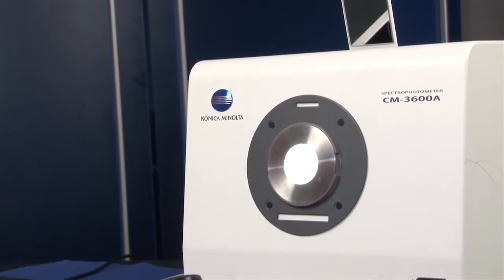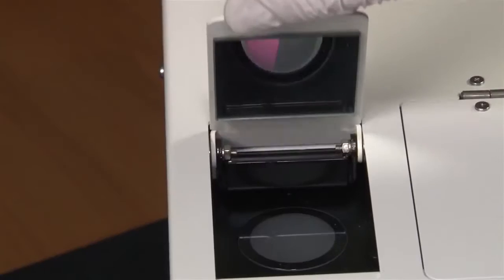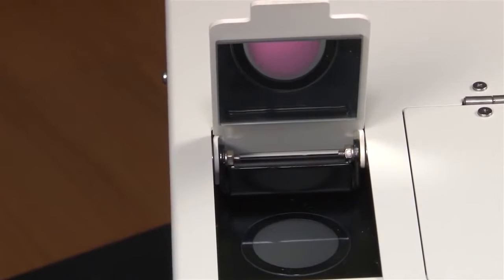The sample viewer provides a clear, illuminated view of a sample to accurately target and control the measurement area.